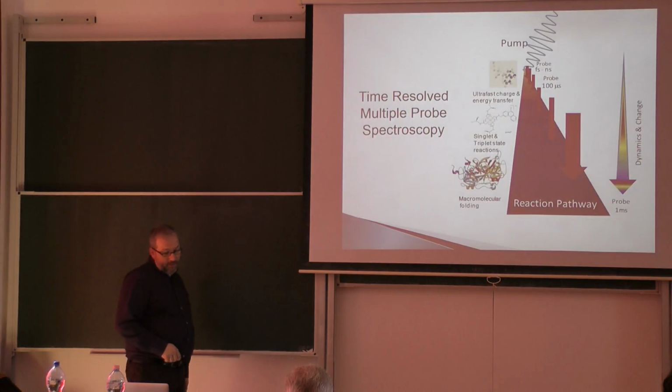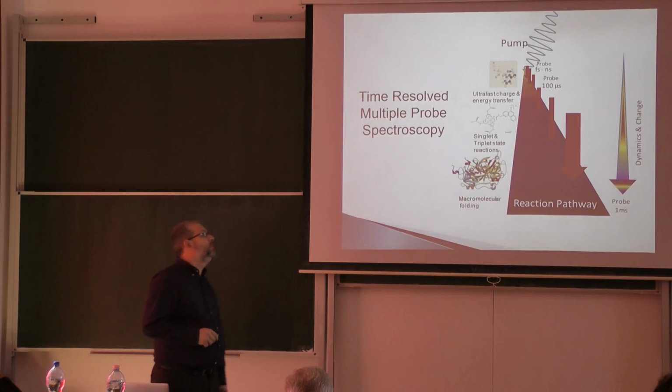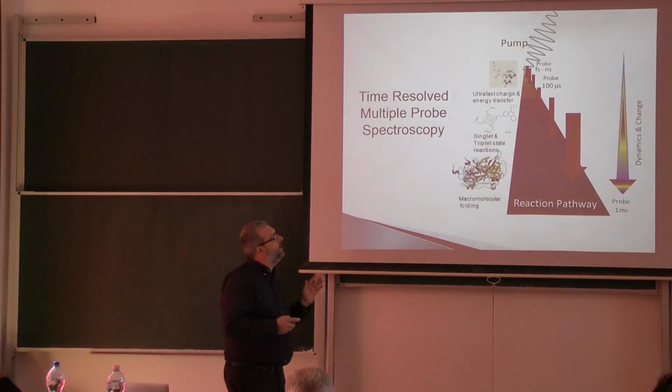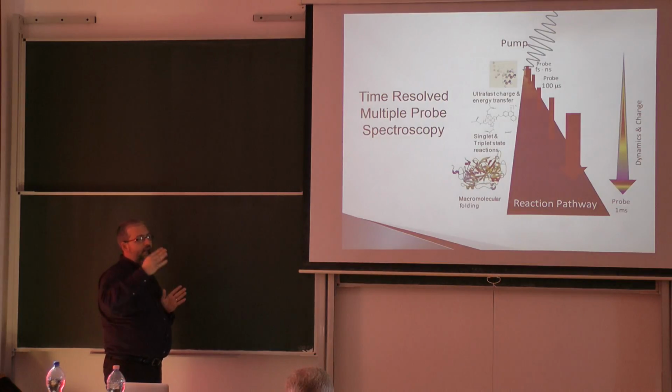Now we have something I don't have time to explain in detail, but basically this is also a pump-probe method, and we are exciting with a blue beam or with some kind of beam at the very beginning, and with electronic devices, we can use 10 other probes, at 10 different time steps, and we can have a probe at every 100 microseconds.